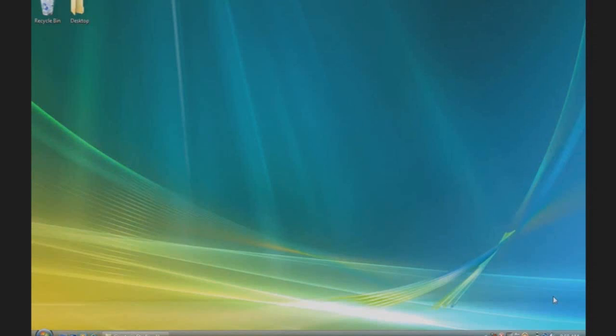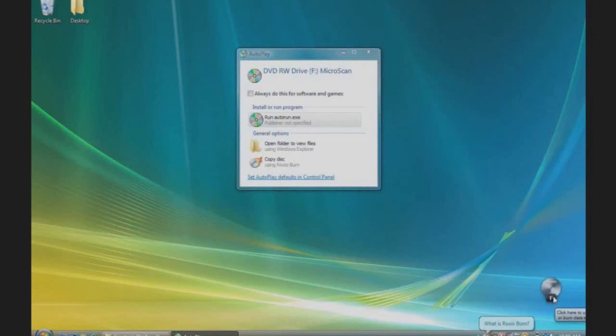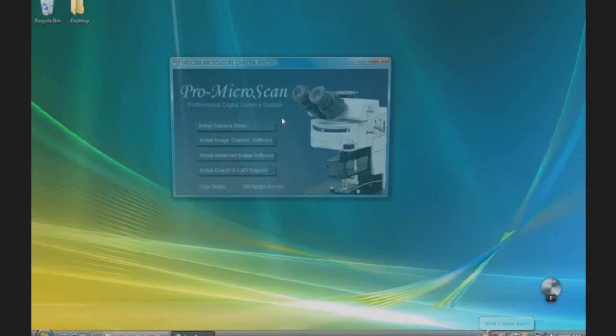To begin, turn on your PC and place the Scope Photo installation CD into your CD-ROM drive. The installation program should start automatically. If it does not start automatically, select My Computer from the Start menu, then select Scope Photo, and from the available files, select Autorun.exe.